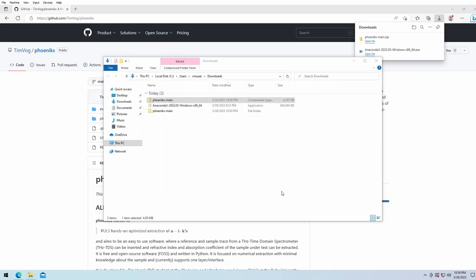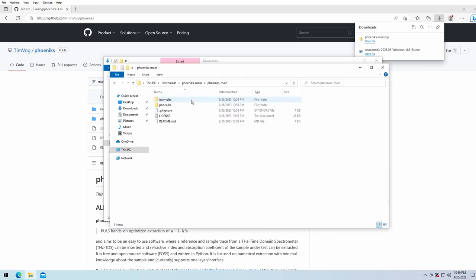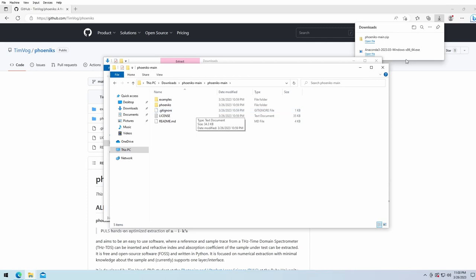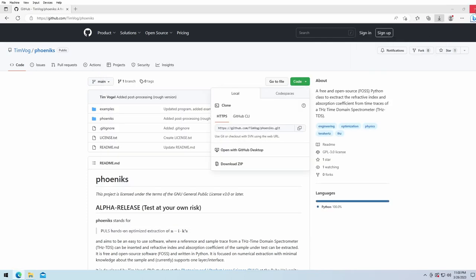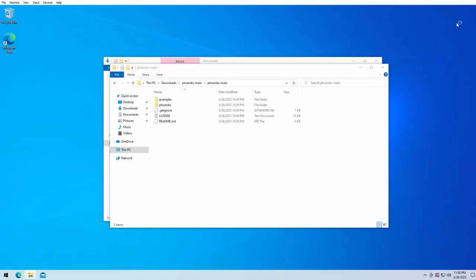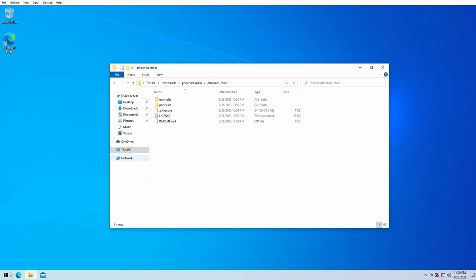We should now have a simple folder called phoenix main. We can close the internet browser in the background, we don't need that anymore. We can now go to the Windows menu.